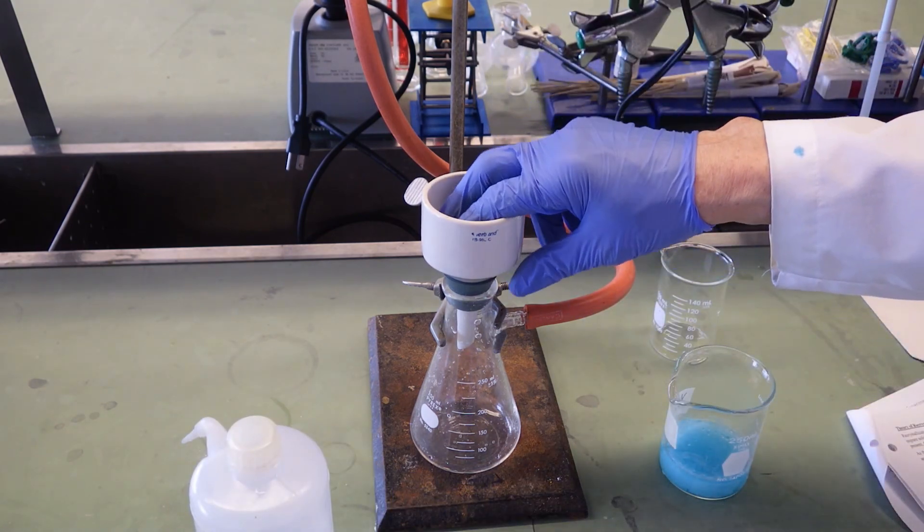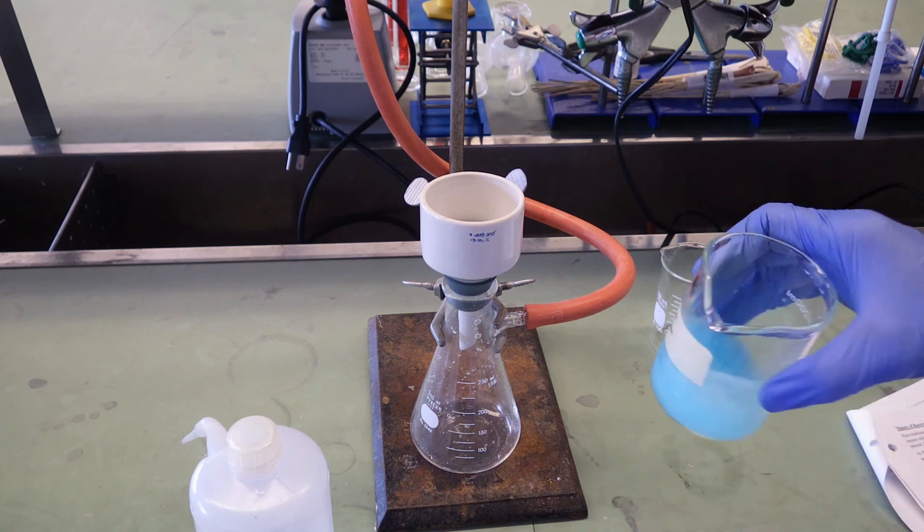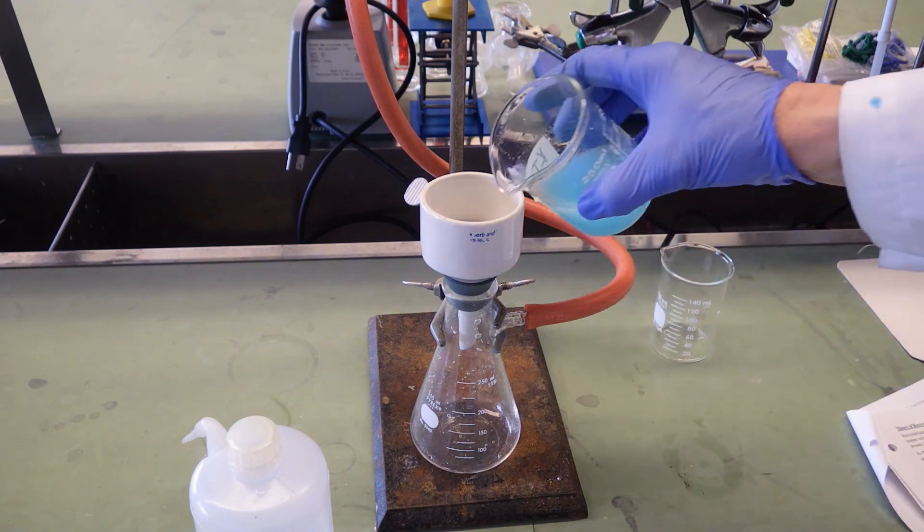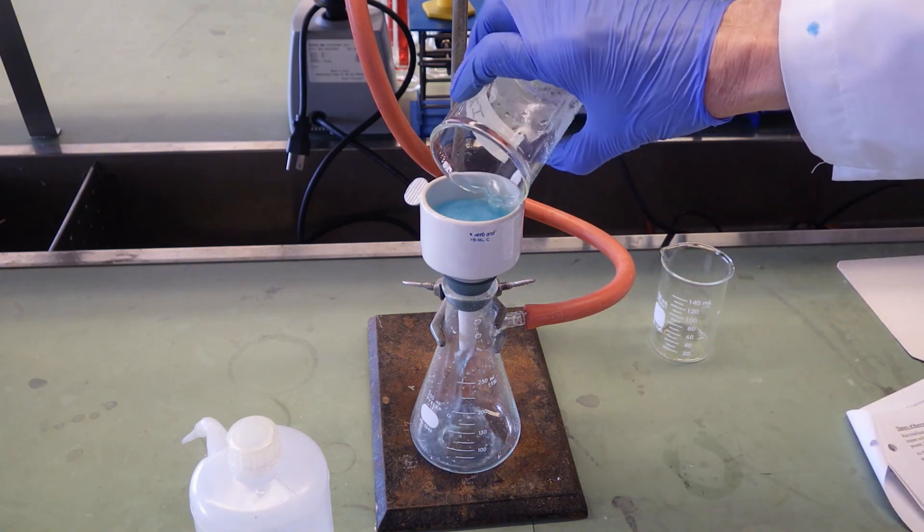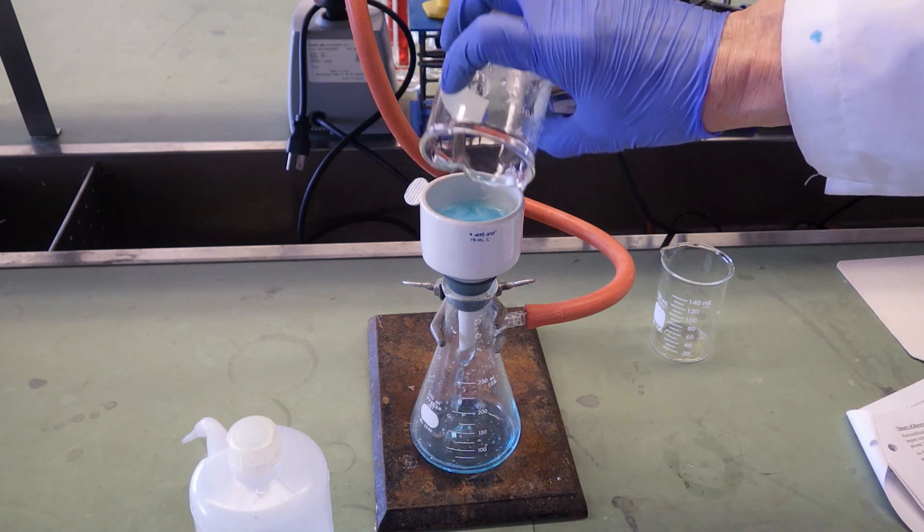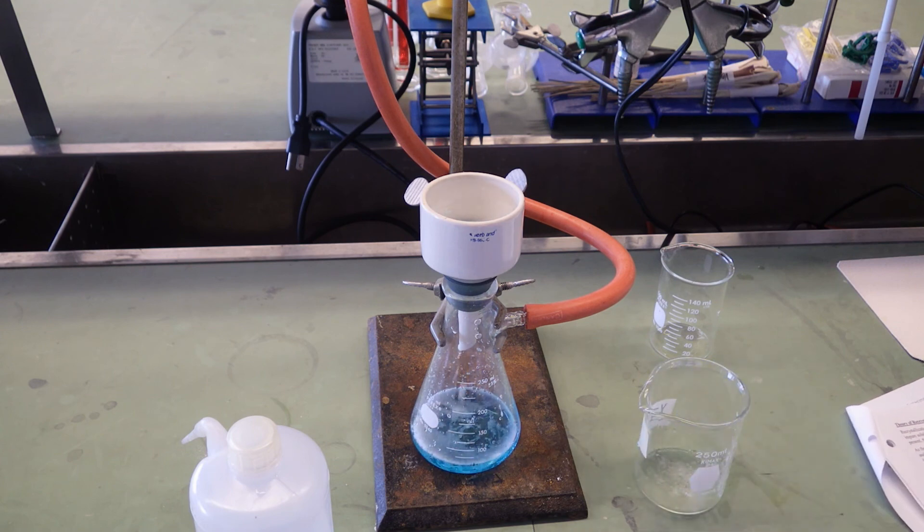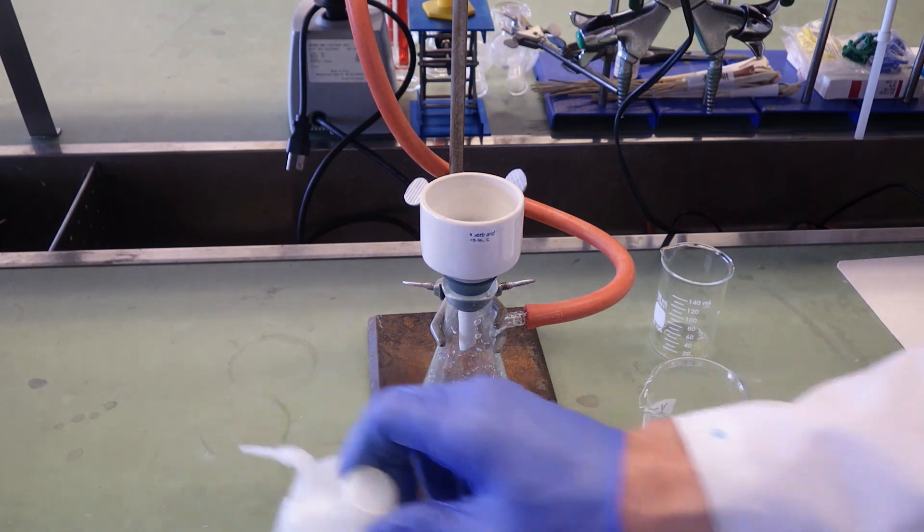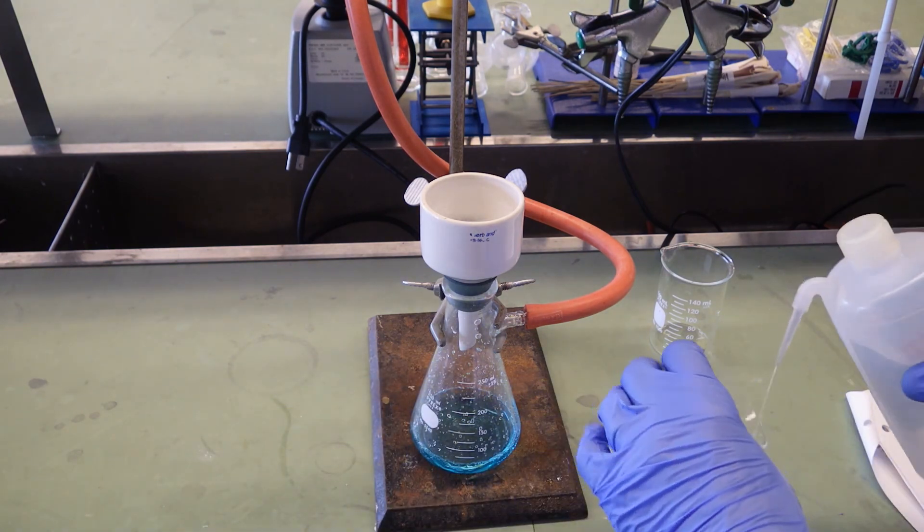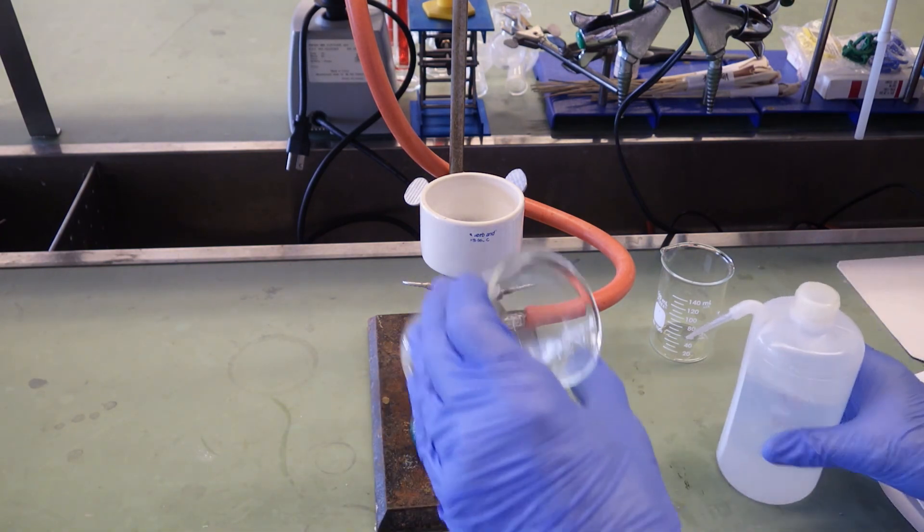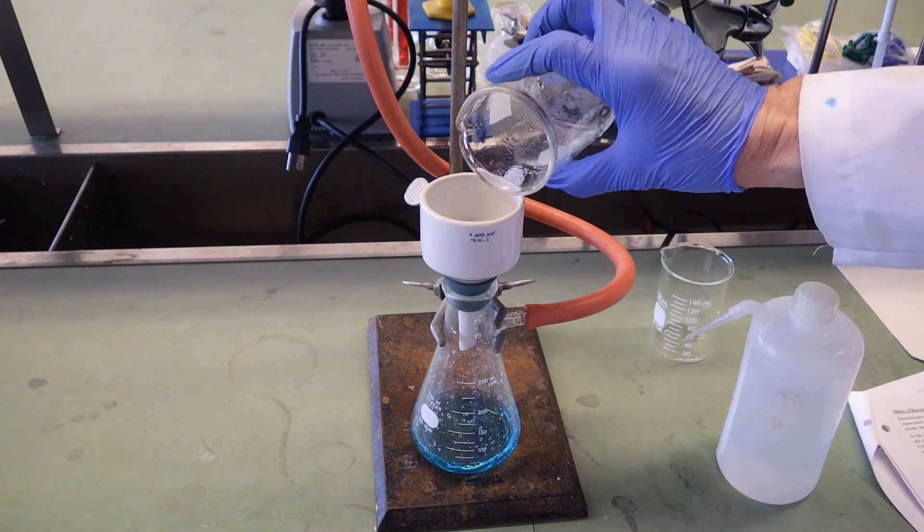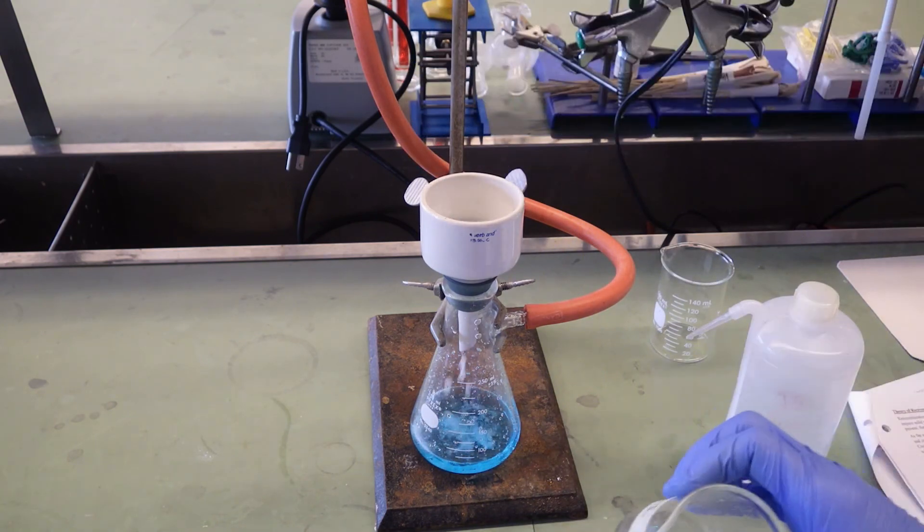Whenever you pour solids onto a Buchner funnel, pour them quickly—as quickly as you can without spilling it—so that you cover the entire surface of the filter paper. You don't want to clump in the middle; you want it evenly spread over the surface. Similarly, when you wash that precipitate, spread water over the entire surface. Don't spray it on. This is the way it's done industrially—it's called plug flow on vacuum filtration systems.